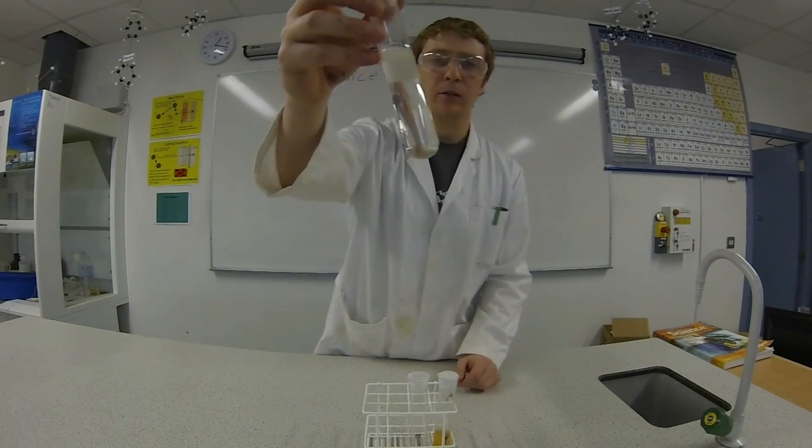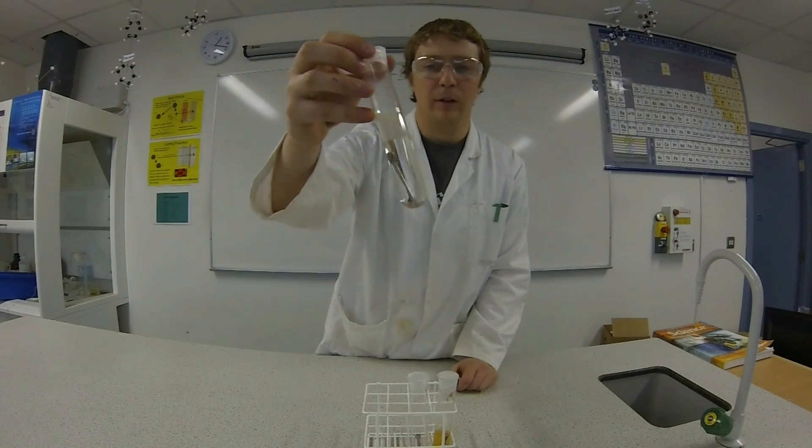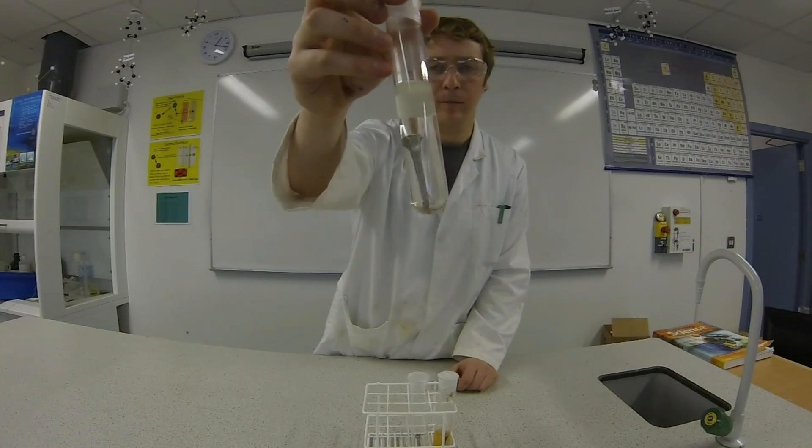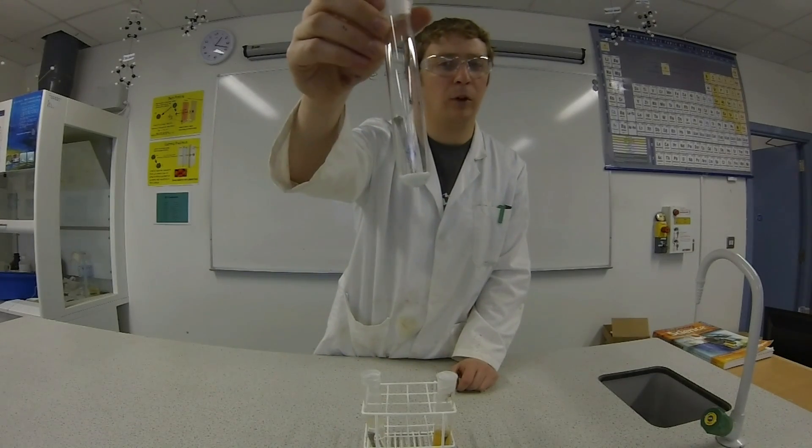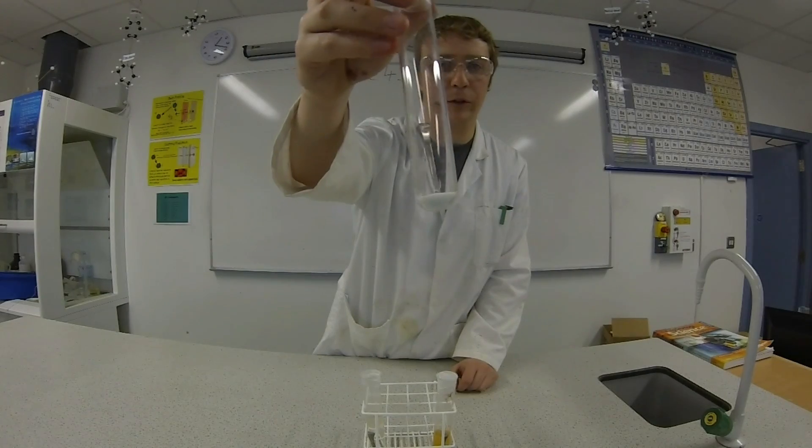If you check out this test tube, it had water but no oxygen, and there's no rust on that nail. In the second test tube, we had oxygen but no water, and there's also no rust on that nail.